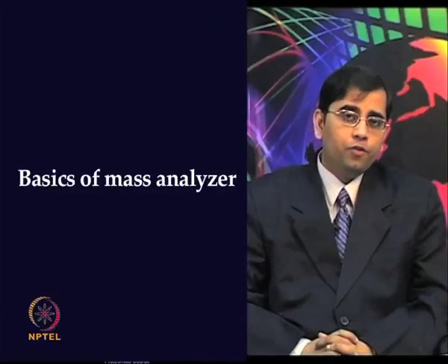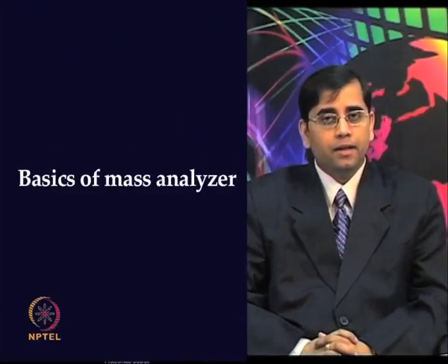There are different types of mass spectrometers currently available, but for proteomics there are two configurations which are most often used: the quadrupole time of flight or QTOF based configurations and hybrid linear ion trap Orbitrap instruments.